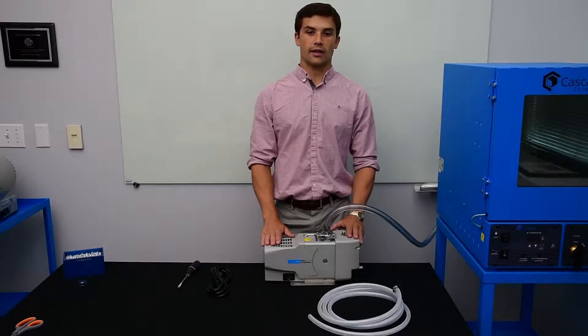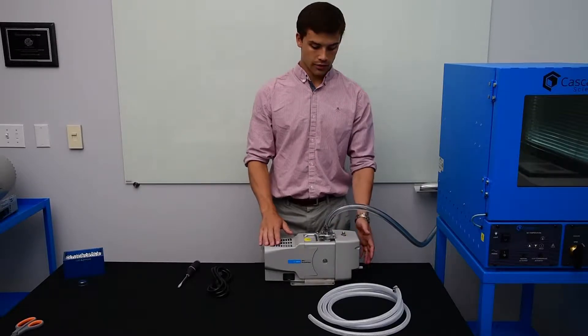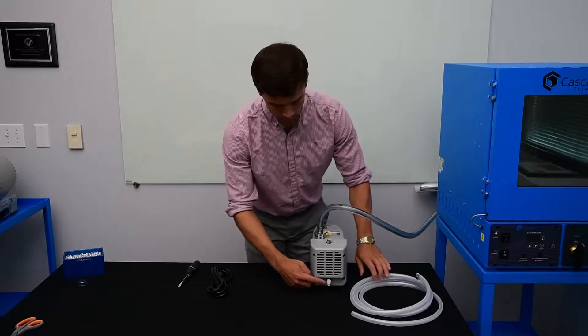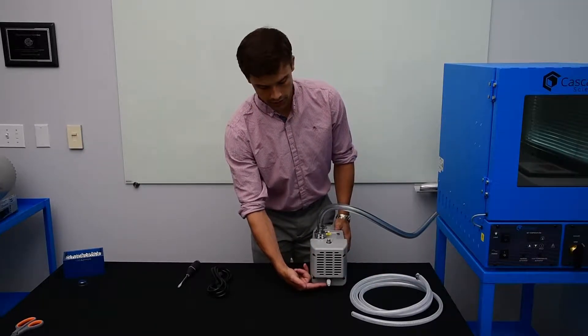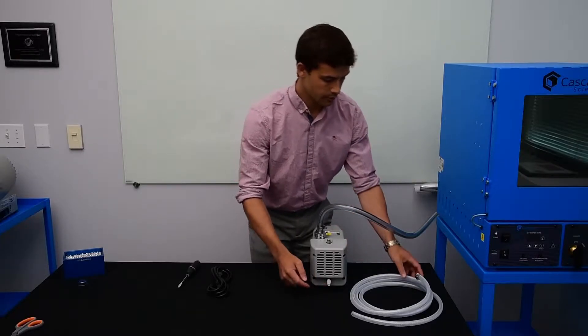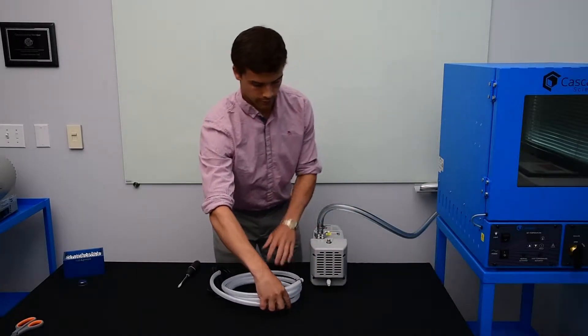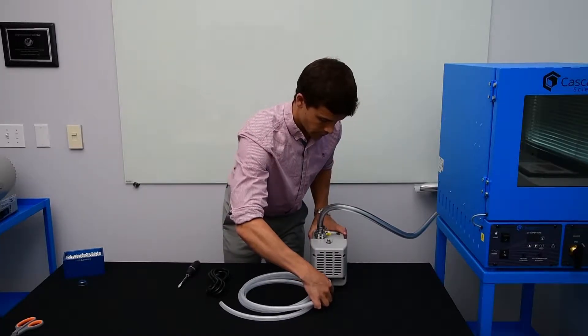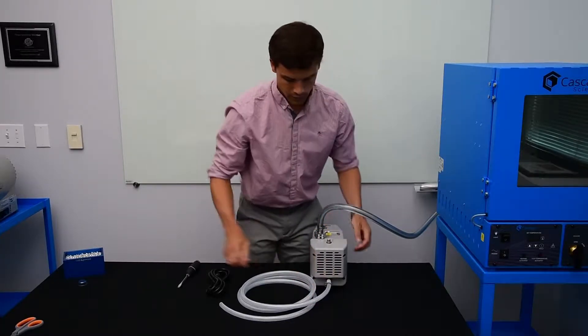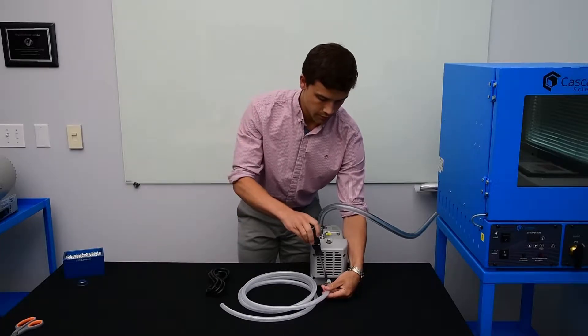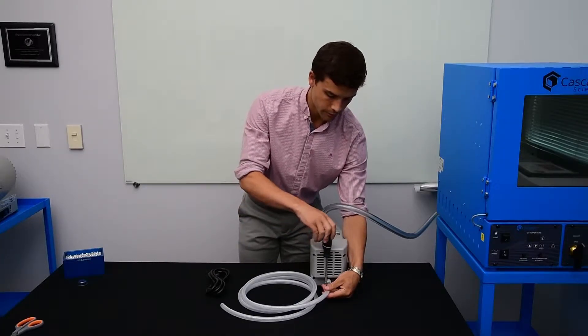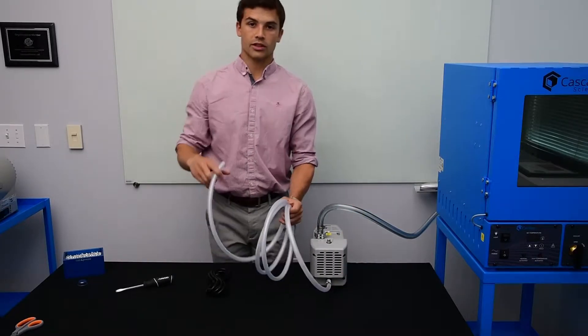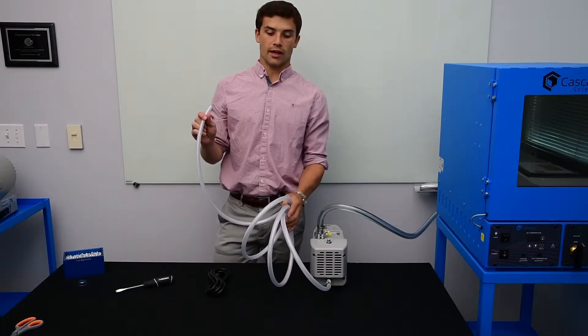Now, we're going to go ahead and install the exhaust hose. The barbed exhaust fitting is located at the front of the IDP3 scroll pump. We're going to install the hose and then tighten the clamp. You want to route this away from the working area.